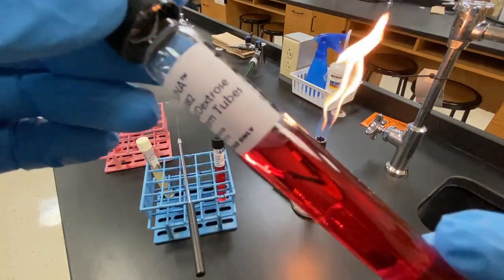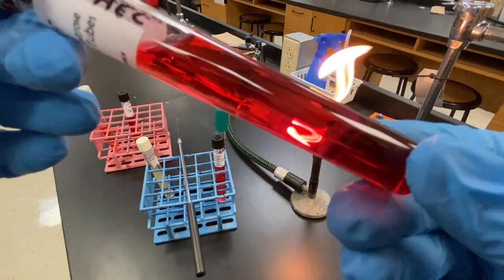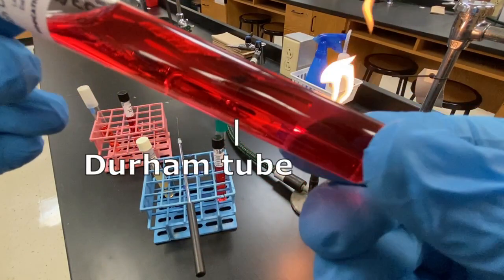Within the broth tube, there is a smaller glass tube called a Durham tube. The tube is inverted, with the opening at the bottom of the broth tube. Another byproduct of fermentation can be gas, so the Durham tube is there to capture any gas that might be produced.